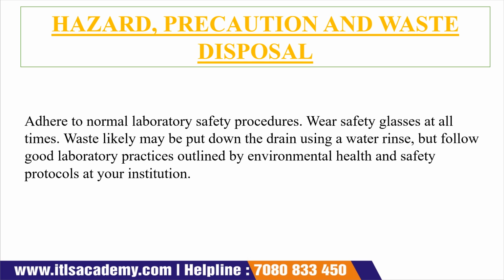But when we are draining it with water, we have to follow good laboratory practices which come under the outline of environmental health, and along with it we also follow the protocol that our institution has given. Now see what is written in the slide. Adhere to our normal laboratory safety procedure.